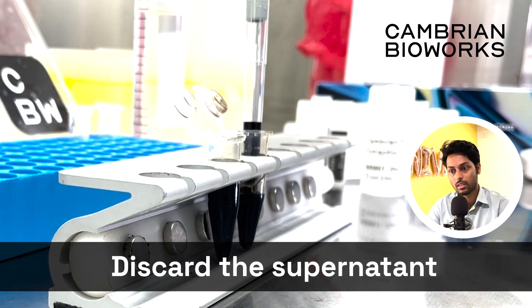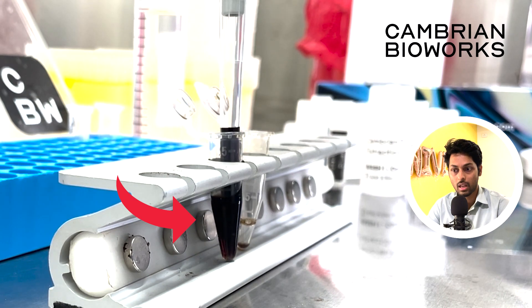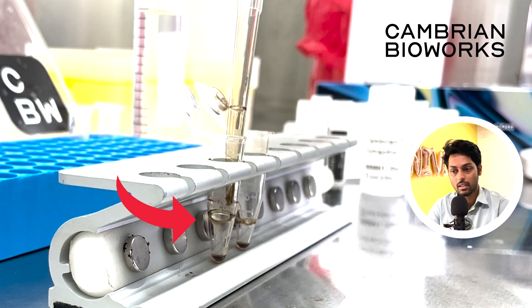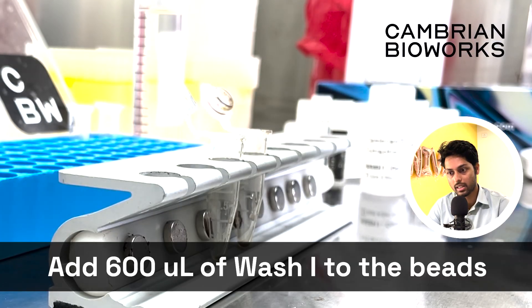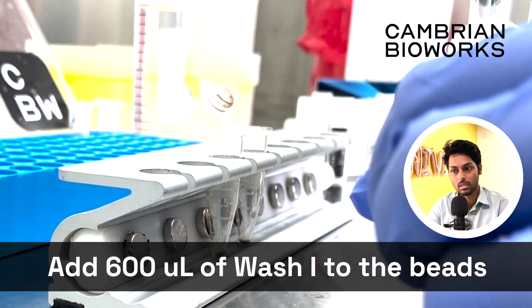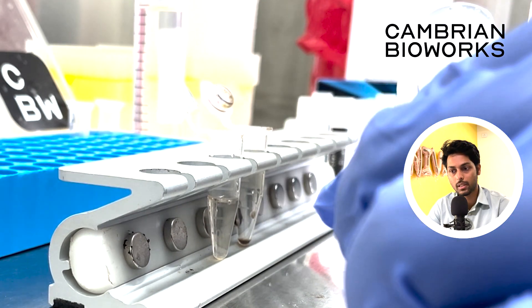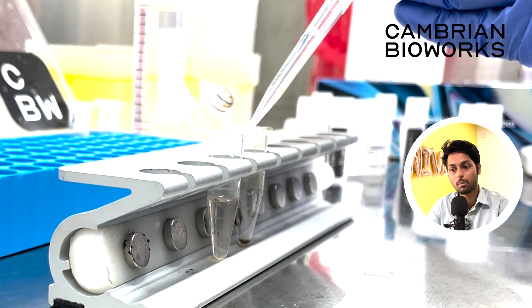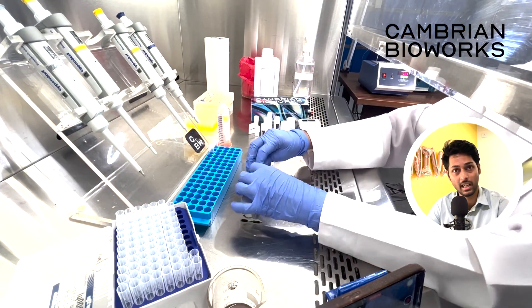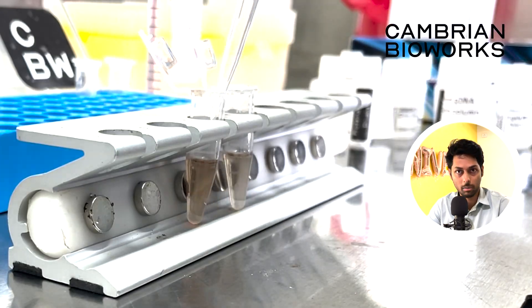Once vortexed, remove the supernatant from this mix. Do it very carefully the first time and ensure that you see the beads are separated. Once you can visually see the beads, the next steps become much easier. Add Wash 1 to this mix — 600 microliter of it when you're starting with a 200 microliter original sample — and vortex that mix thoroughly for as long as prescribed in the protocol.